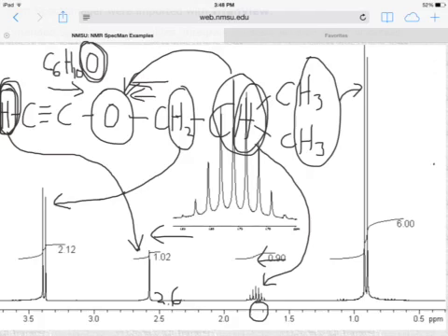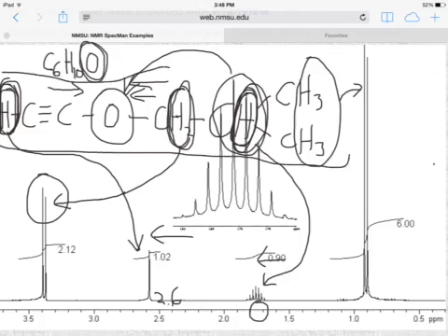And it looks like all the splitting is as we'd expect it to be. For example, this methylene here is split once, it's a doublet, and in our molecule that makes sense because it's only near one other hydrogen that would split it. So when I look at this, all of the signals from our hydrogens are where we'd expect them to be, and all the splitting is how we'd expect it to be if the NMR spectrum was from this molecule. So I feel pretty confident that we've solved this NMR.